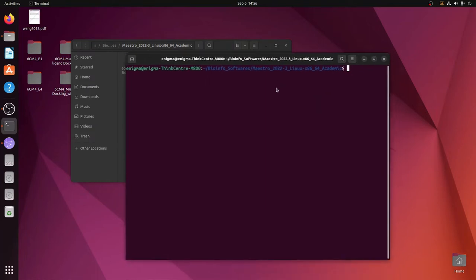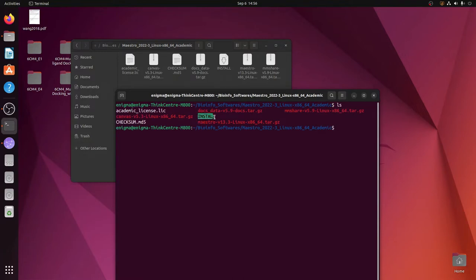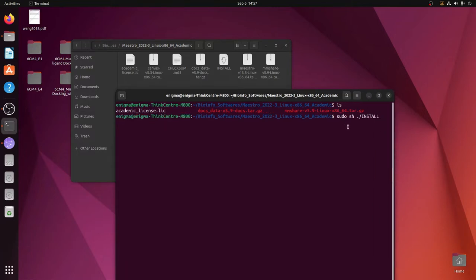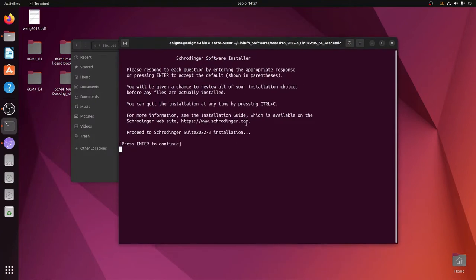We can check the files by typing 'ls' and hitting Enter. Now we need to run the install script, but we will use the superuser command. Type the command: sudo sh ./install and hit Enter. This is the command you need to type in the terminal inside the extracted folder. Press Enter and it will ask for your password. Enter your password and the installation will begin.